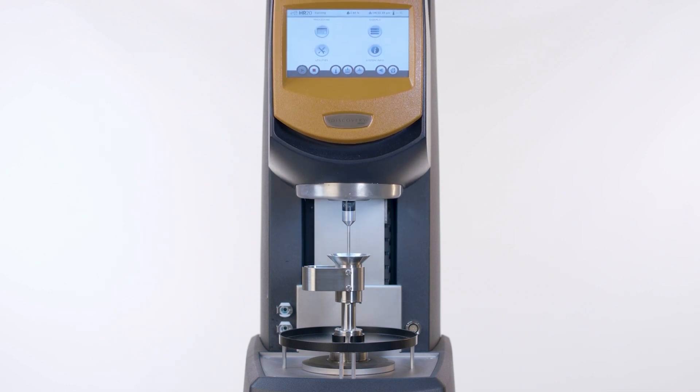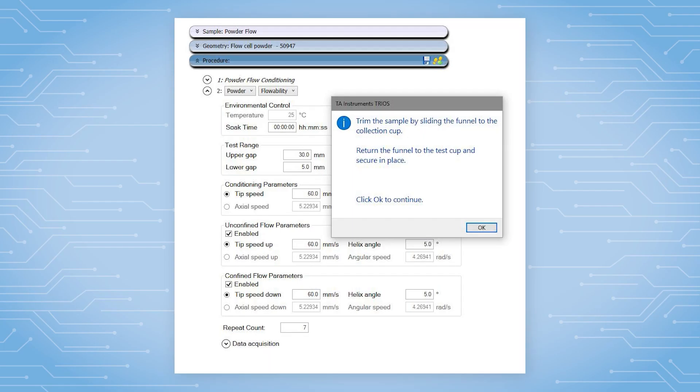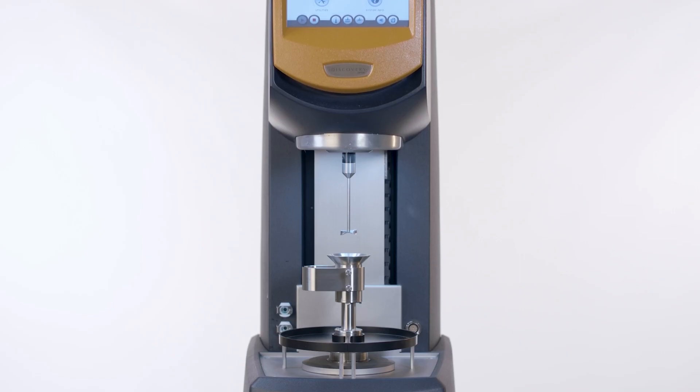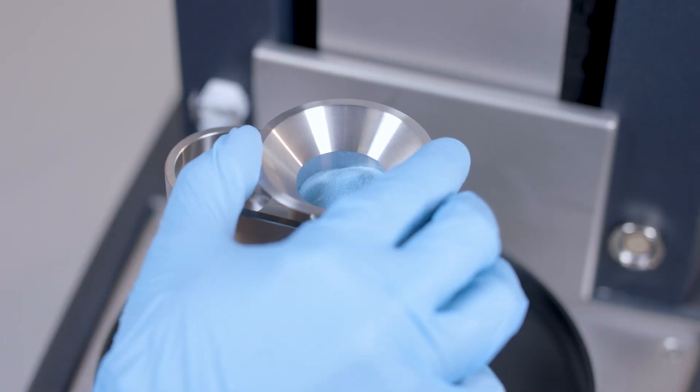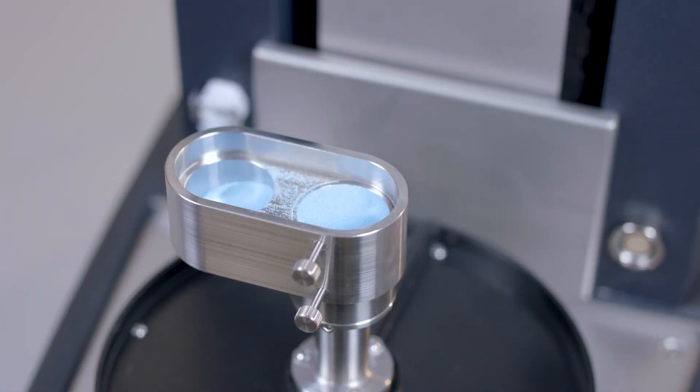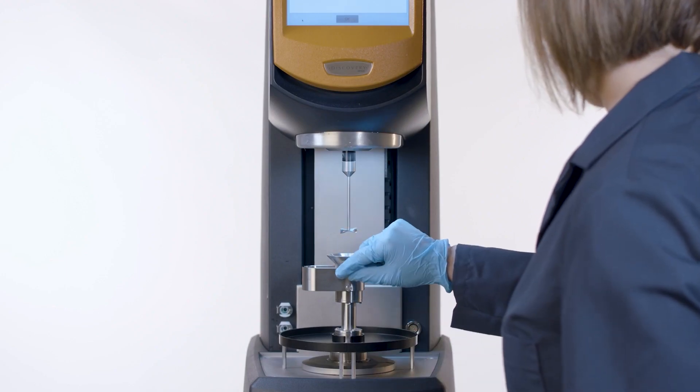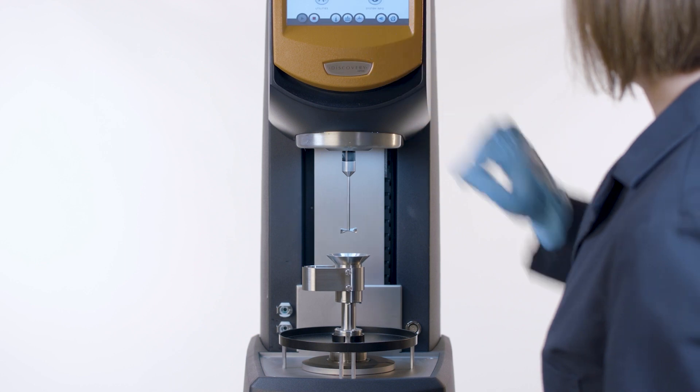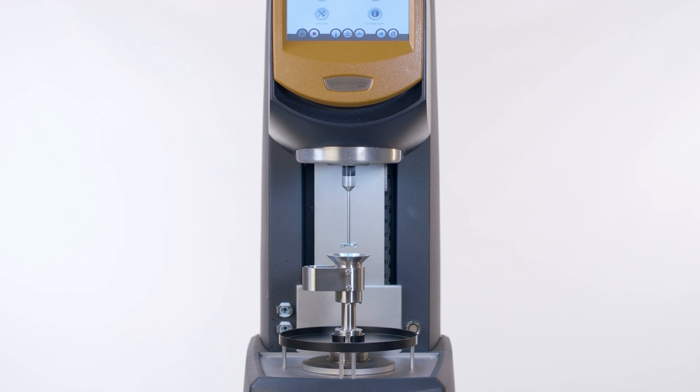After the conditioning step is complete, follow the prompt on the rheometer screen or in the TRIOS software and trim the sample. Loosen the upper set screw and slide the funnel, removing excess powder and depositing it in the collection cup. After trimming, return the funnel to the testing cup and secure it by tightening the set screw. Press OK on the touch screen or in the TRIOS software to move on to the measurement.